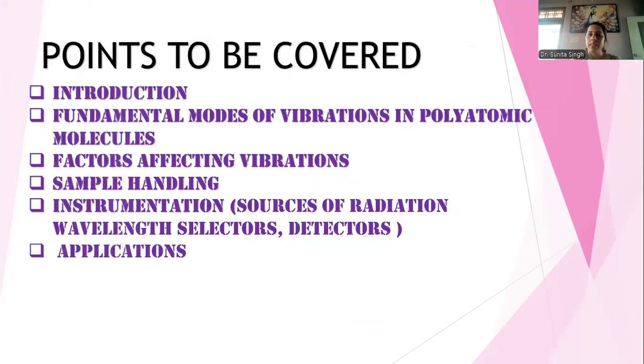So in this lecture, we are going to cover points like introduction, fundamental modes of vibrations, factors affecting vibration, sample handling, instrumentation, and its applications. As I have earlier told, it is very difficult to compile everything in one lecture, but I have tried. At least you can get a gist, as well as how it is going to be applied in different areas.